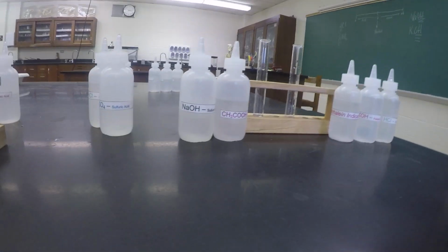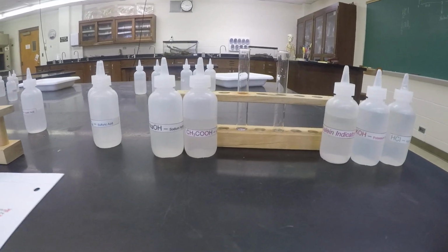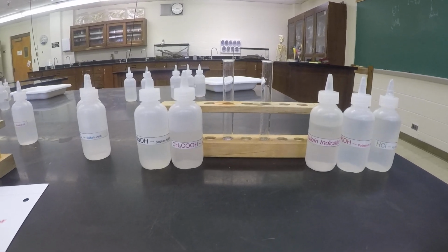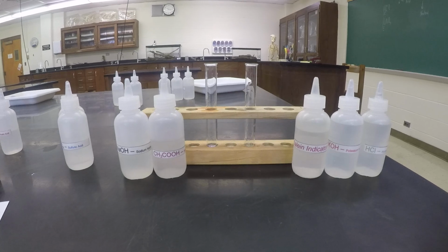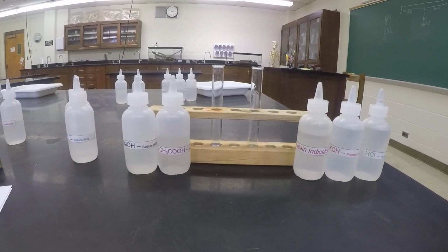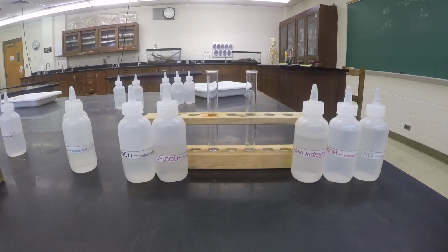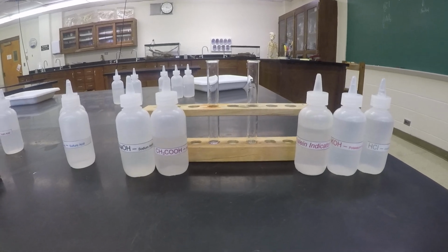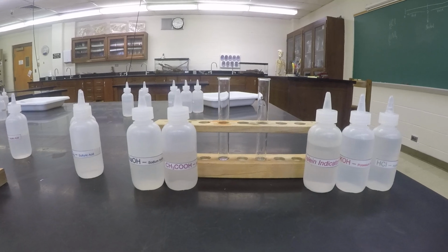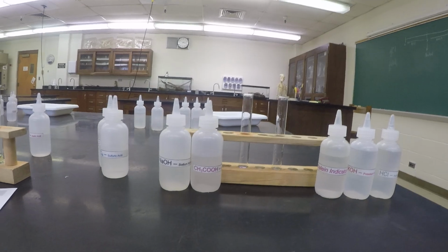The next thing we're going to do, which is part 5, is called neutralization of acids and bases by titration using the cabbage extract indicator, which is a big, long, scary sentence that everybody starts panicking over, and they really don't need to panic over. It's basically saying that I'm going to neutralize an acid and a base and make a salt and water solution by titration, which means I'm going to add them a drop at a time, and I'm going to use the cabbage extract as my indicator dye.